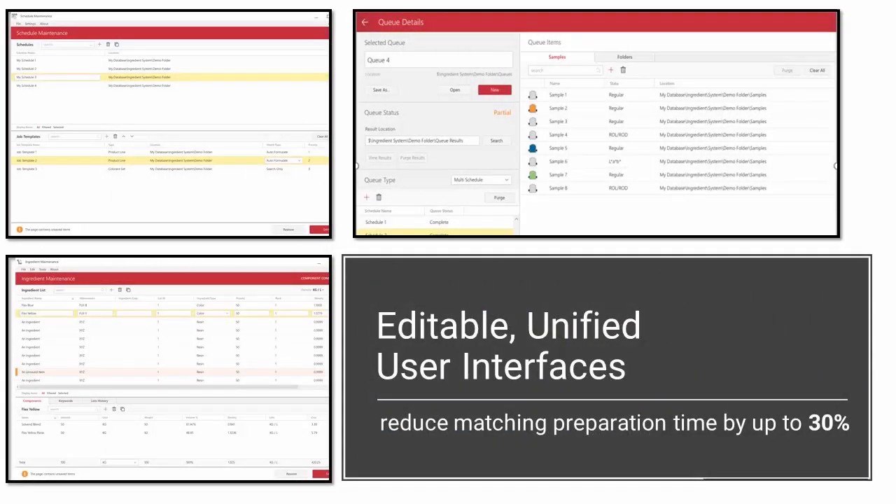To make the software easier to use, a uniform, modern, user-friendly look has been applied to all new modules, and in time this new look will be applied to all modules throughout the software. We have also taken steps to simplify the software, such as allowing the ability to edit maintenance grids, quickly purge samples from cues, open formulas from Navigator by double-clicking, and added the ability to quickly add samples and sample folders to a cue. This new, clean, efficient interface and simplified workflow optimizes throughput and can reduce your matching preparation time by up to 30%.